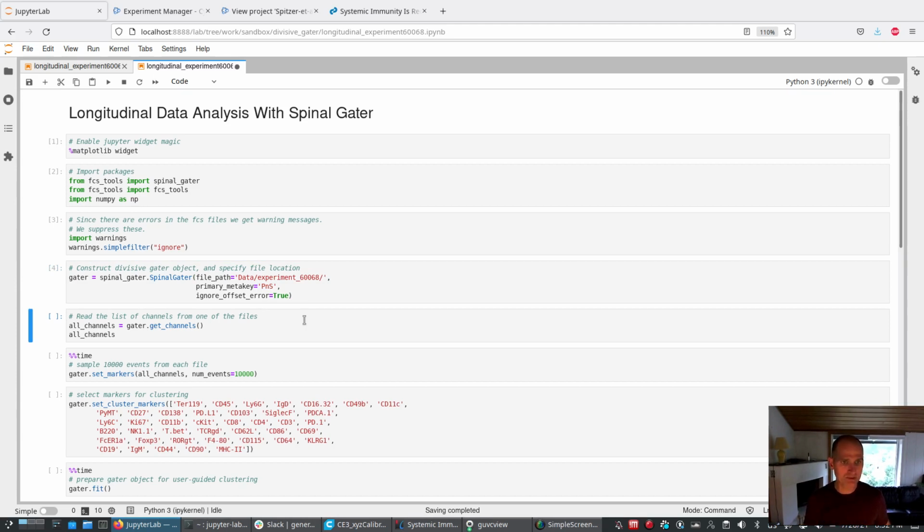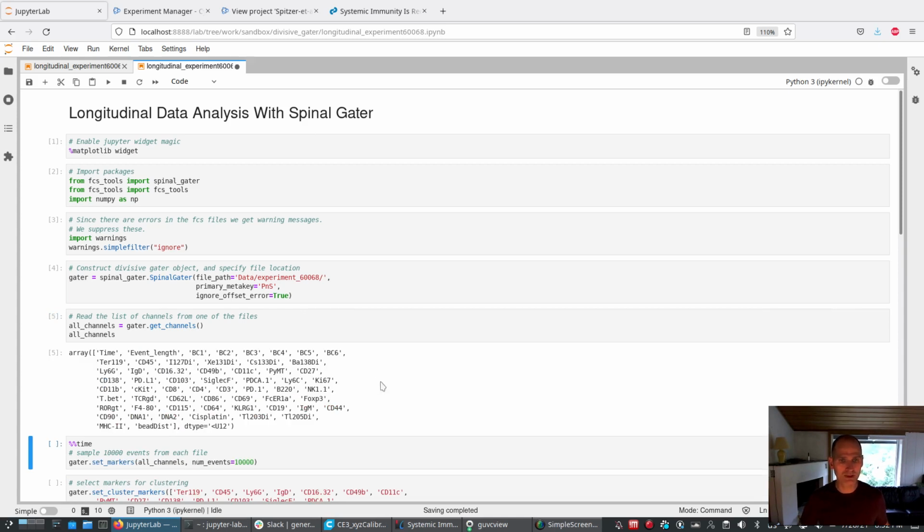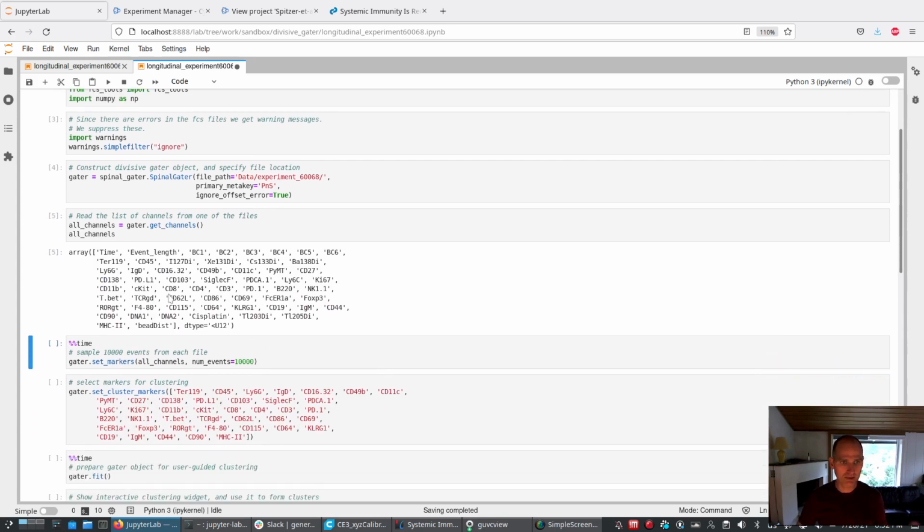I read what the channels in the files are, there's a list of channels, and then I read in a sample of 10,000 events from each of these 26 files. So I'm going to cluster only a subsample of all of the files.